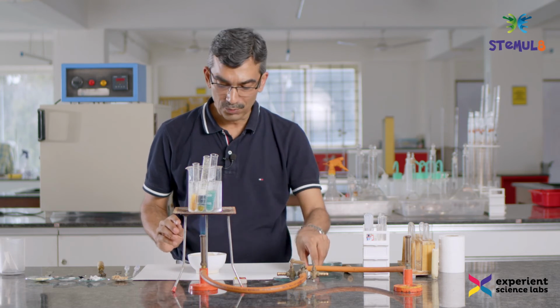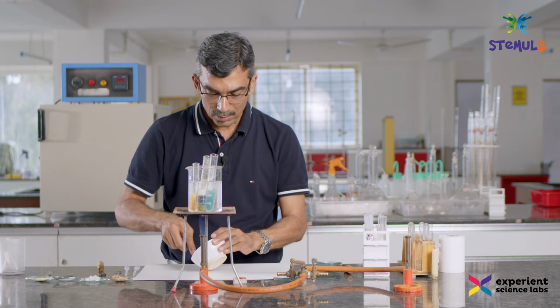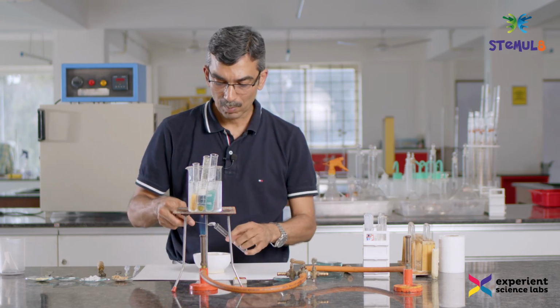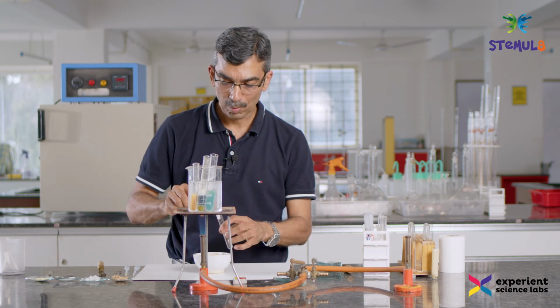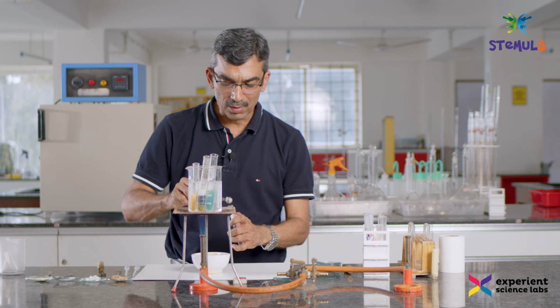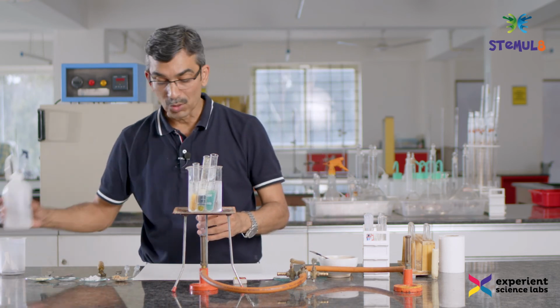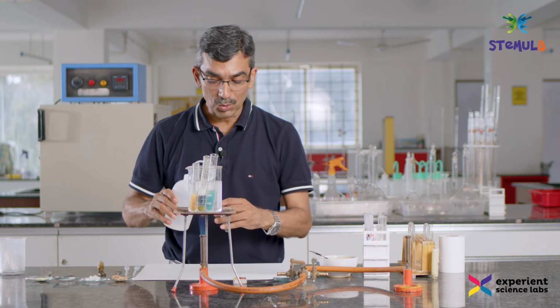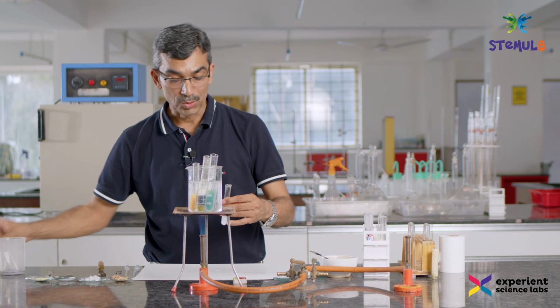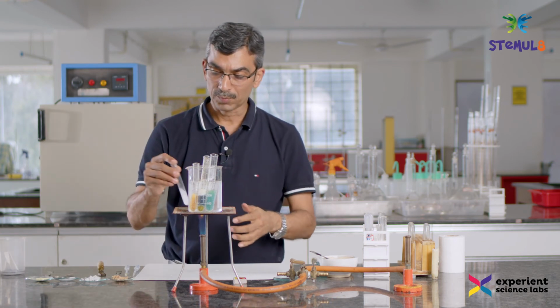I think this is good enough, and with a spatula I will mix it. Even if I add water, starch will not dissolve, but if it has vitamin C, it will dissolve in water. Vitamin C is water soluble and it should come out. Mix it well.